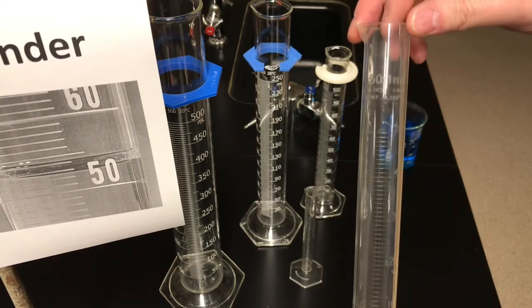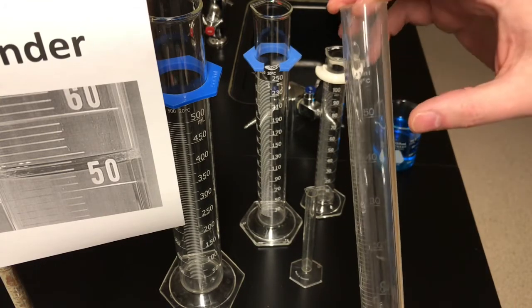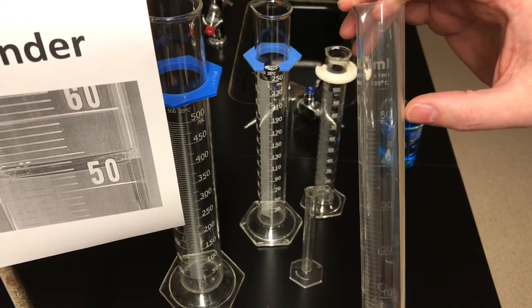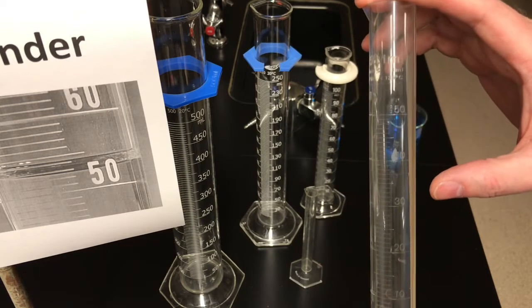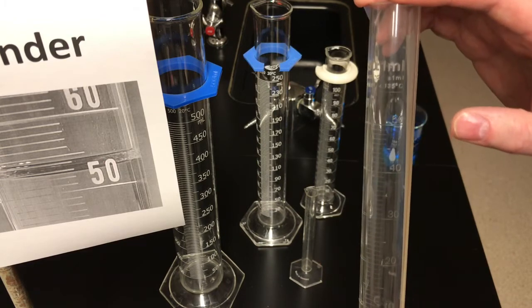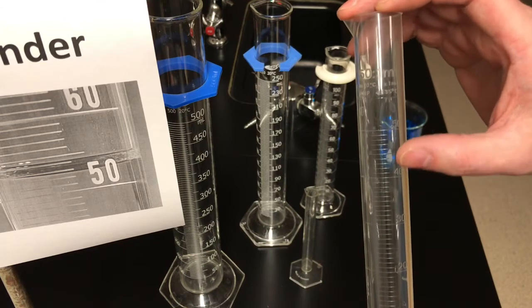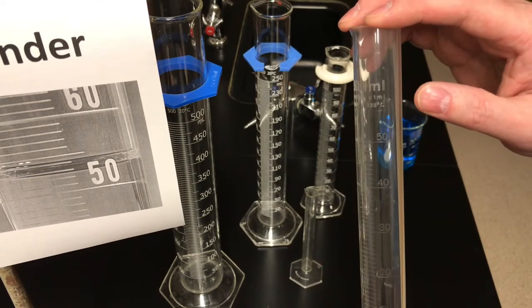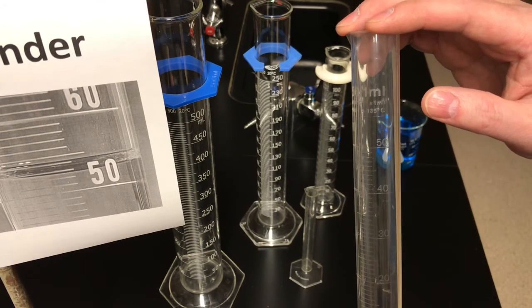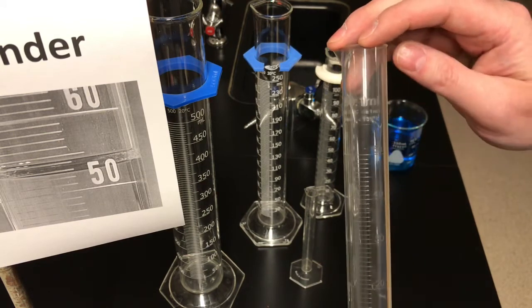Here's a cylinder you'll use quite a bit in the lab — a plastic graduated cylinder with a 50 mL total volume. The major scale, going from 30 to 40 to 50, is 10 milliliters. Again, there are 10 tick marks, 10 graduations. So take that 10 mL major scale, divide by 10, and each graduation here is 1 milliliter.